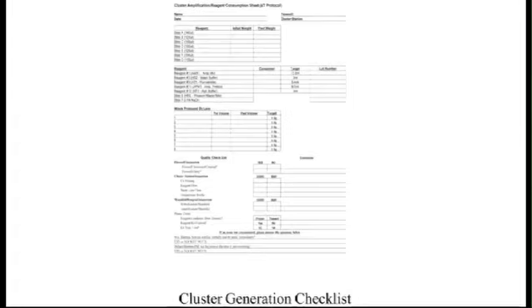We visually inspect the reagent tubes before and after use, recording their lot numbers and checking for proper consumption by using the gradations on the tubes. We also check the waste produced by lane by weighing the 15 milliliter waste tubes before and after the process.